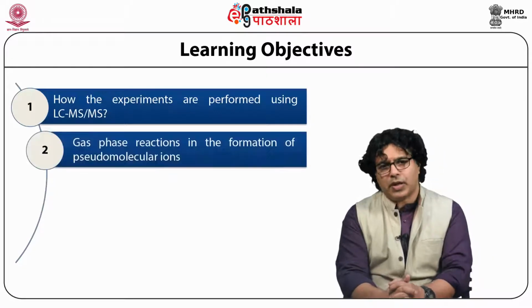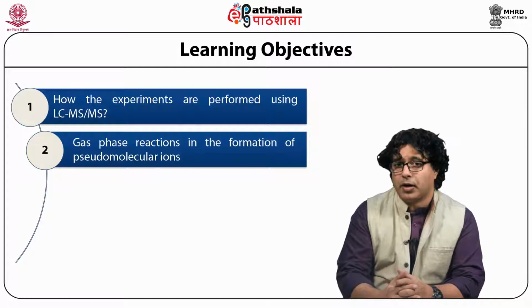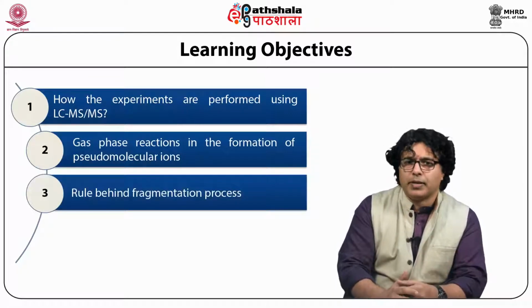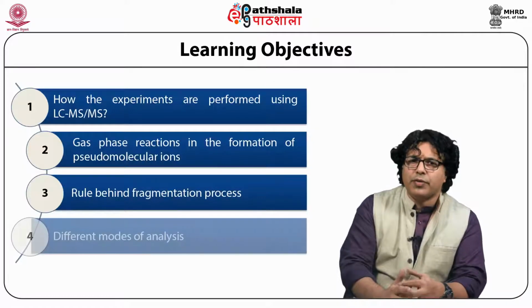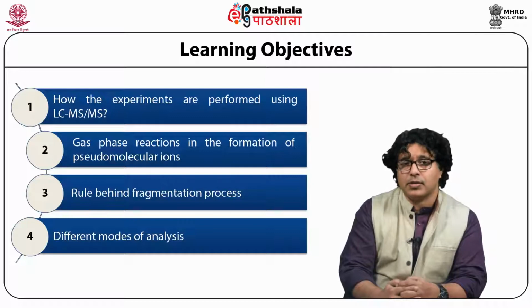What are the gas phase reactions happening in the formation of pseudo-molecular ions, the rules which are applied behind the fragmentation process, and the different modes of analysis. These are all the things we are going to see in today's talk.